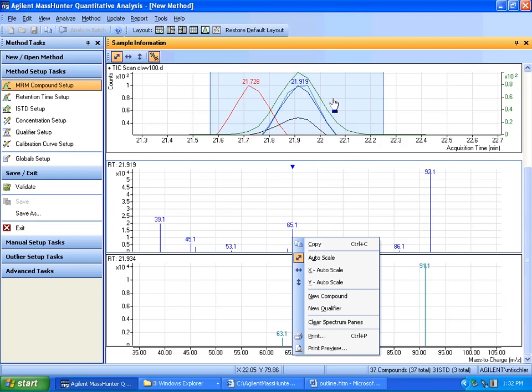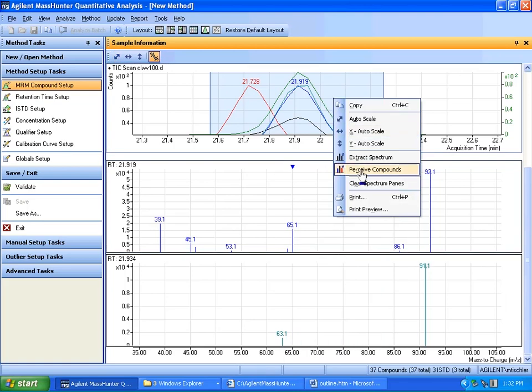So I think that gives you a demonstration of how you can take an area and exercise the deconvolution algorithm to help you figure out your quantitation method and explicitly check to see how pure the compound is in terms of applying that method using scan data to figure out your compounds.